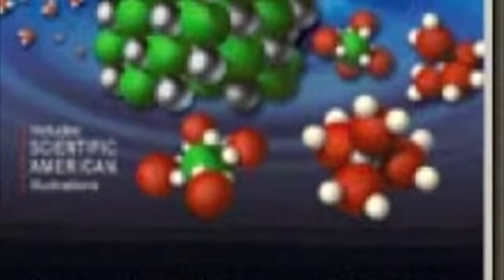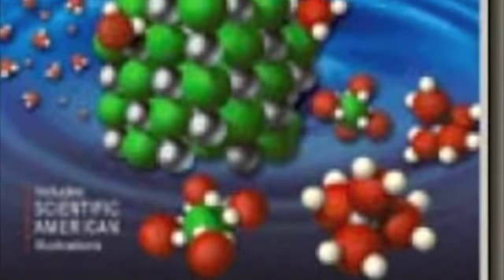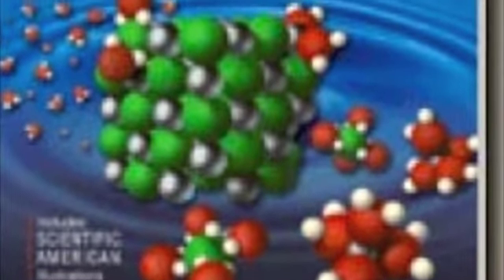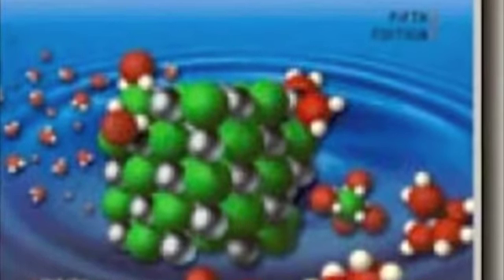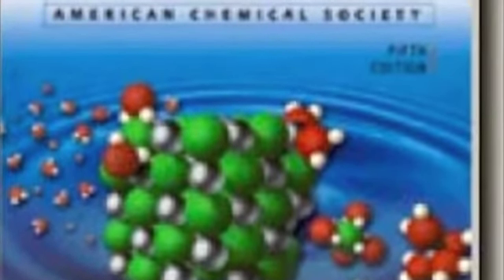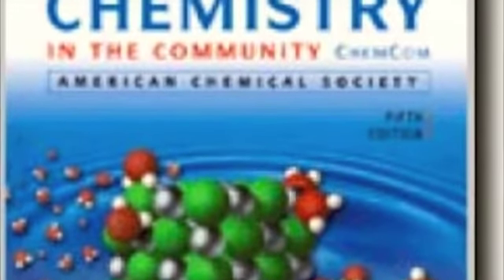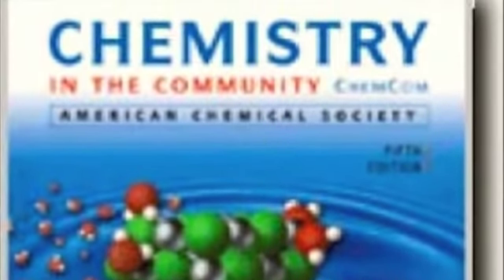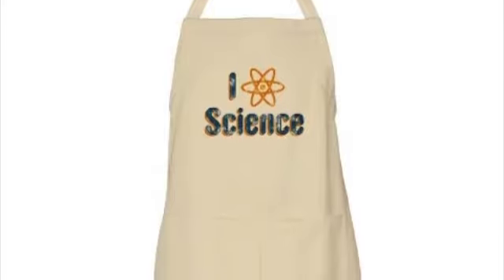The purpose of the Ester Artificial Flavoring Lab is to recognize the aroma of foods due to some of the combinations of the esters. In this lab, we will be learning how to name esters. An ester molecule is formed when an alcohol and an organic acid molecule come together and a water molecule is released. While doing this lab, wear goggles and an apron at all times.